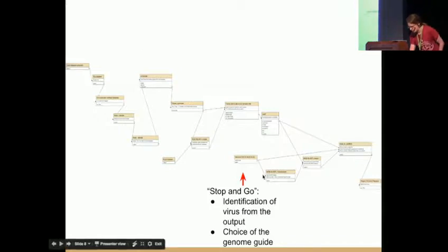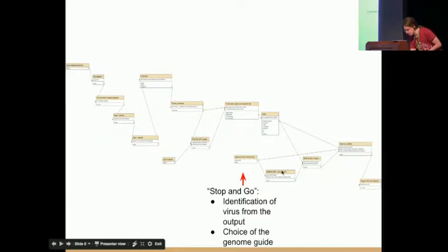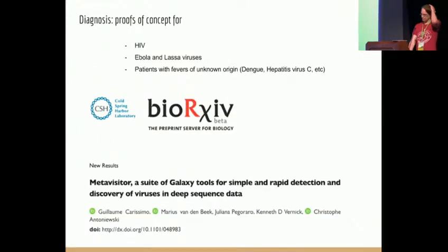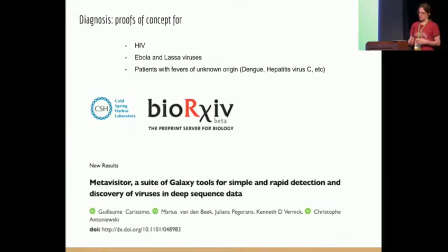Yeah, there is another tool, I don't think you can really read that, but okay, I was saying that you get this table, so you select the genome that you want, and then you just assemble that specific part. So it's really quite easy. We have developed this together with biologists, and we have deposited a preprint for this workflow.